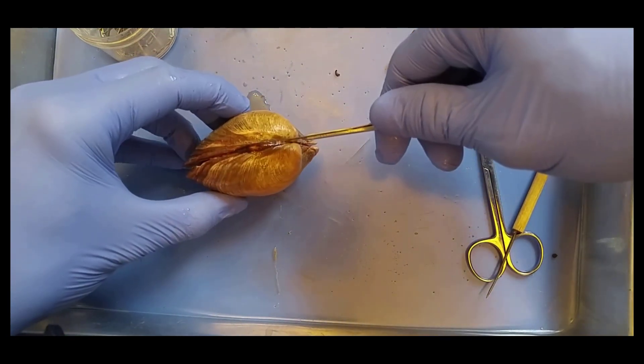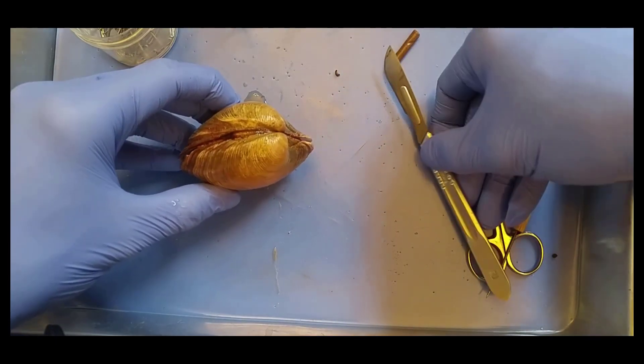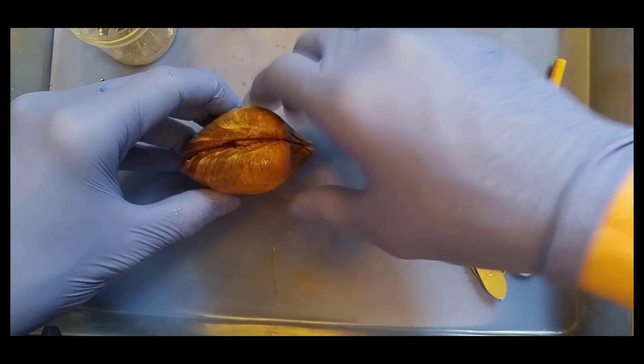And here we have a hinge ligament. The hinge ligament works antagonistically with the adductor muscles to open the shell. So the adductor muscles close the shell. The hinge ligament snaps open and opens the shell.